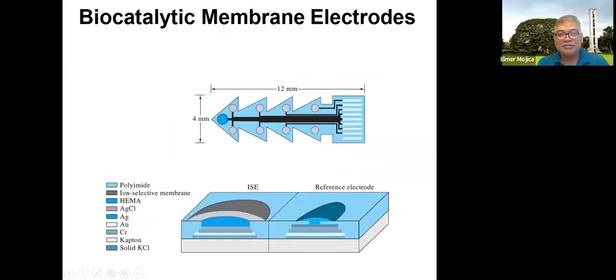Okay. Another way to look at it is this microfabricated potentiometric sensor for the in vivo determination of analytes. So they're already available. Okay. I'm not sure if you know about the story of Theranos. Have you heard that? Or we could say the story of Elizabeth Holmes.